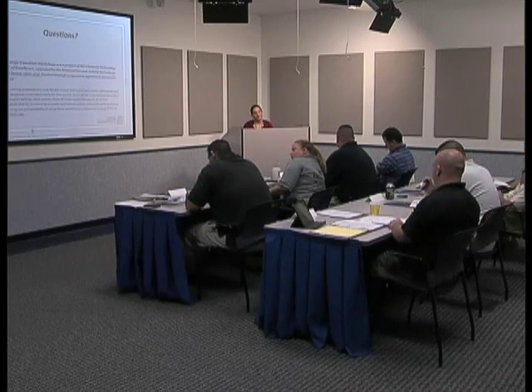Just a scenario of thought. A person complains that they have an odor in their house over a long period of time. Let's say we took a PSPME, hung it in the rafter of a basement, and just allowed it to be there over time, looking for anything that might be of interest to that house. Maybe they're smelling something coming out of the sewer. Maybe they're smelling their neighbor's house flushing down methamphetamine chemicals or something down the drain. Would this work in that type of environment?